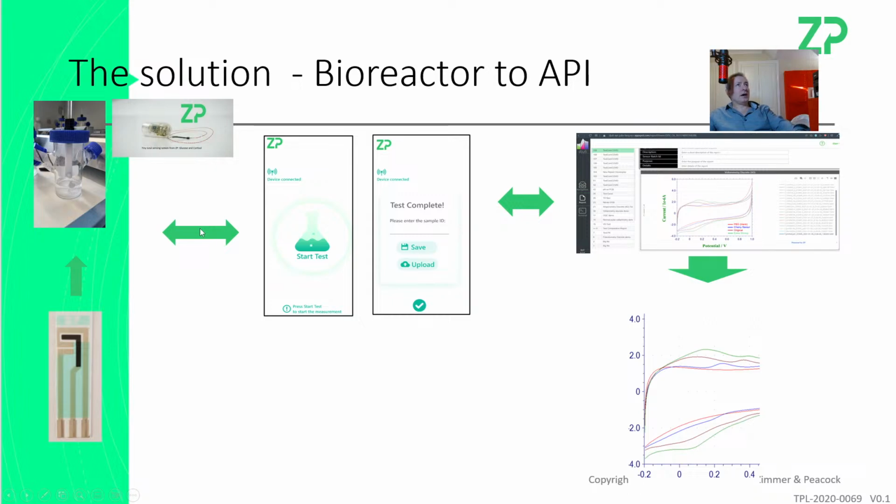So the easiest one for me would be, can we measure pH in a cell culture? The two easiest things to do are probably, can we measure pH and can we measure glucose? The reason I mention that is because pH is a fairly simple and robust sensor. The glucose sensor for us has had a lot of investment, so it's pretty robust. Lactate is a weak enzyme, and the run times we've got so far are like 8 hours. We have to put the investment in. So I'm not suggesting a lactate sensor.